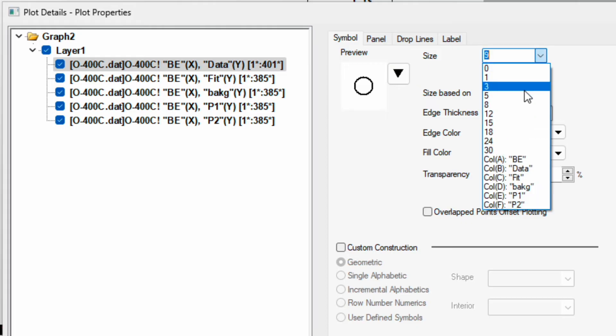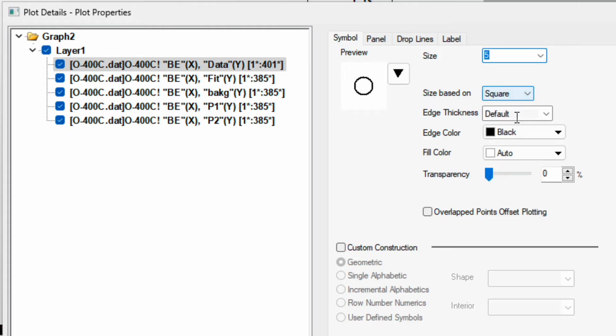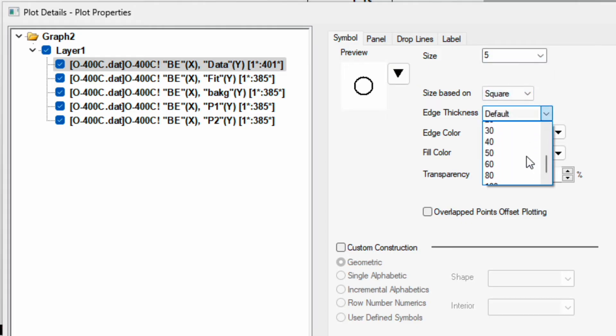Change the symbol type to circle and the size to say 5, and then edge thickness I use around 40.